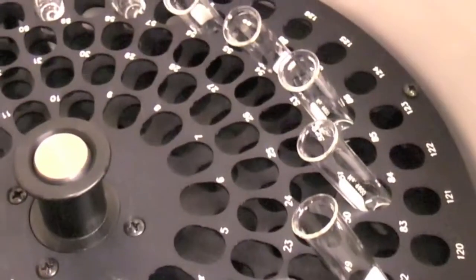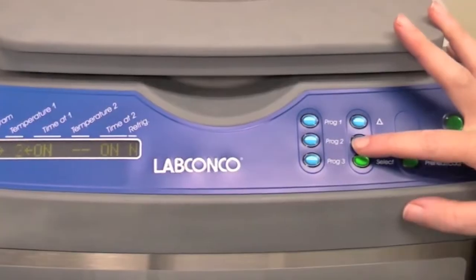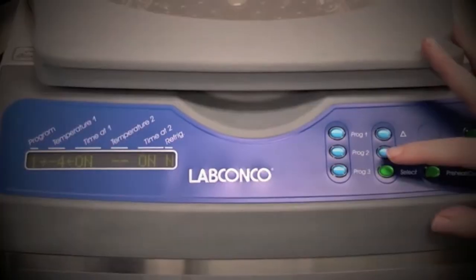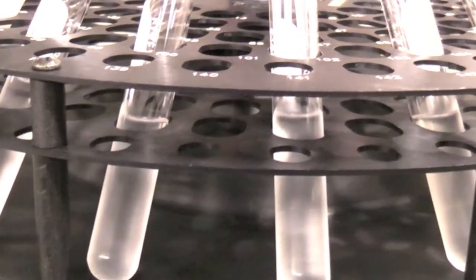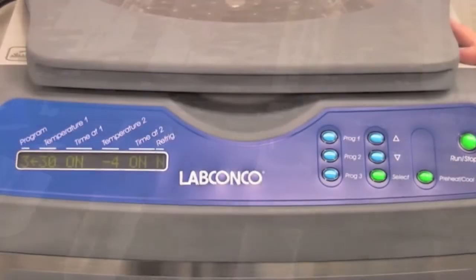During the process of evaporation in any evaporator, evaporative cooling occurs and can freeze the samples during the run. Since the refrigerated Centrivap can reach temperatures of minus four degrees C, freezing will take place. This results in a sublimated sample rather than an evaporated sample and will take longer to get to dryness.